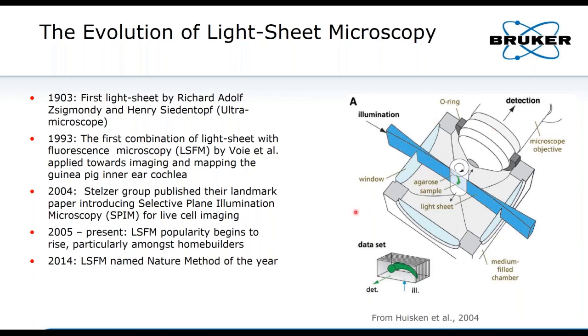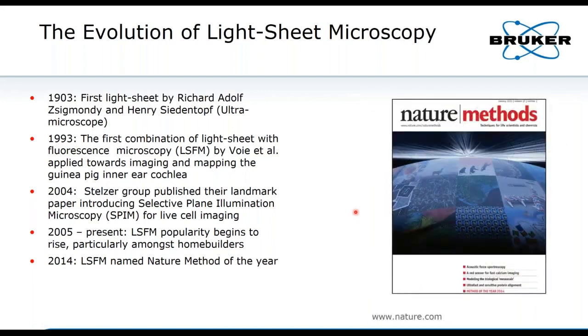And since then, LSFM, as it is also abbreviated, has really undergone a very dynamic development until, for example, in 2014, the journal Nature Methods termed this the Nature Method of the Year.